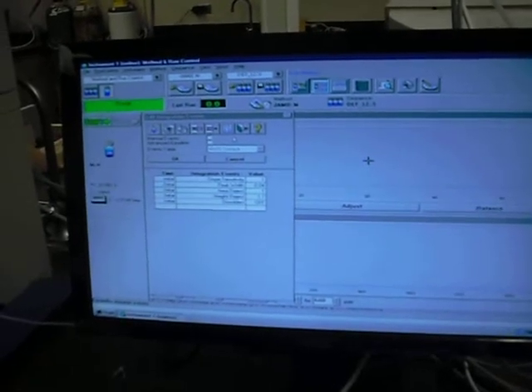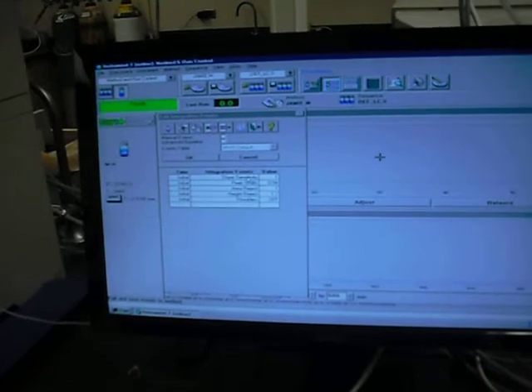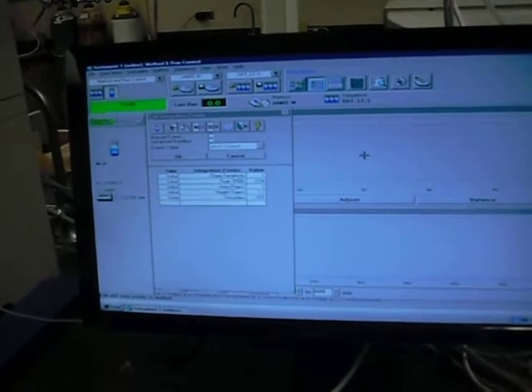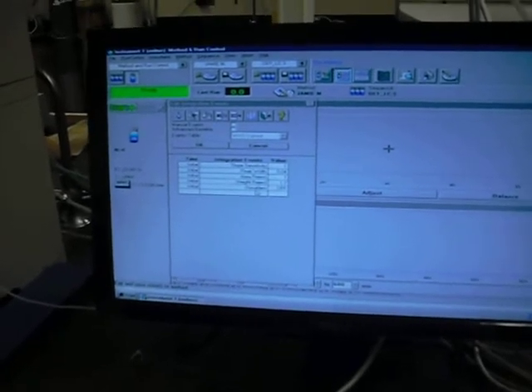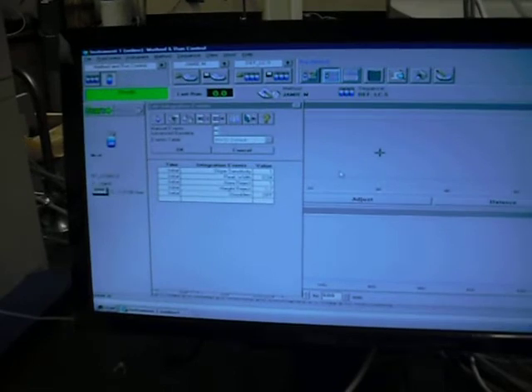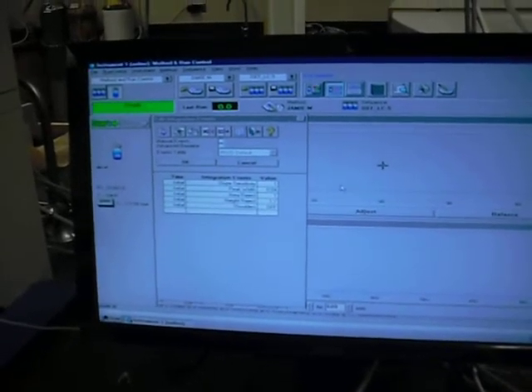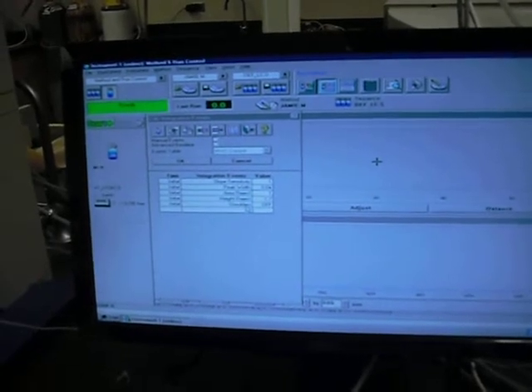This second to last dialog shows some settings that you can change depending on how intense the peaks are that are coming out. This is a little artificial intelligence program that makes a guess as to whether or not a particular elevation in the detector signal should be considered a chromatographic peak or not.